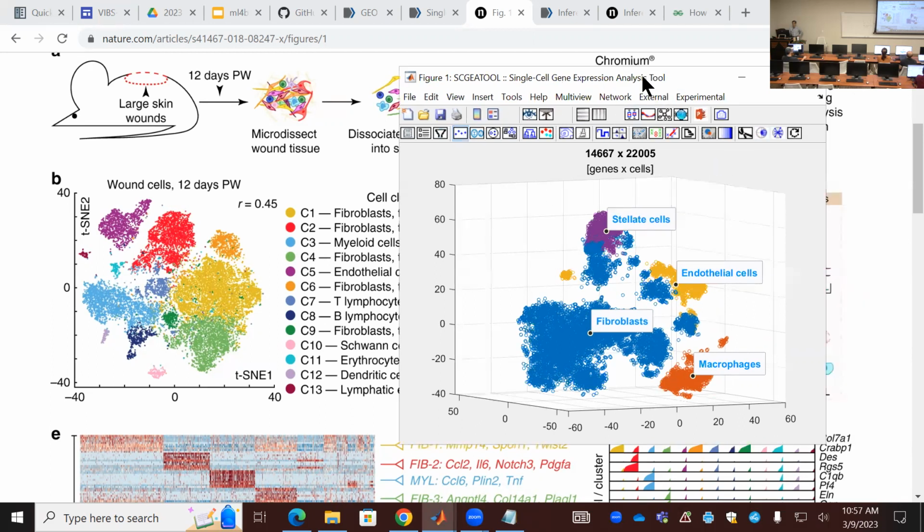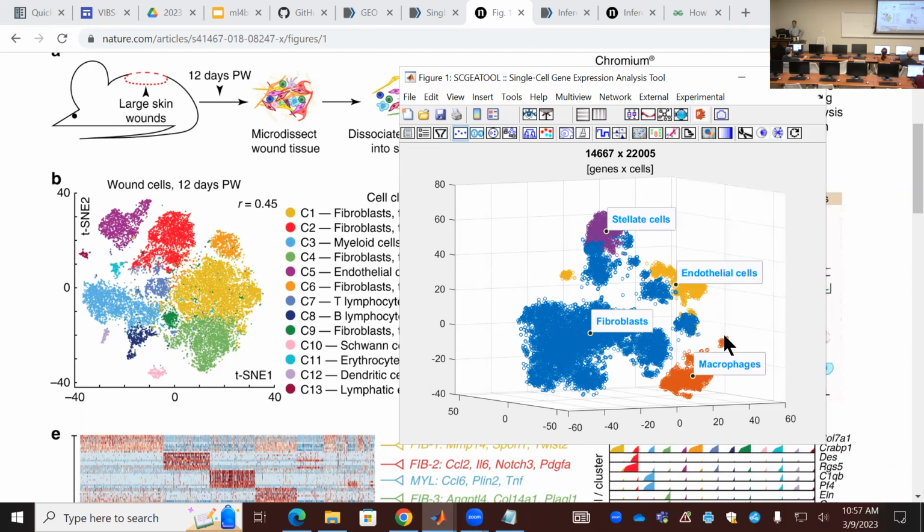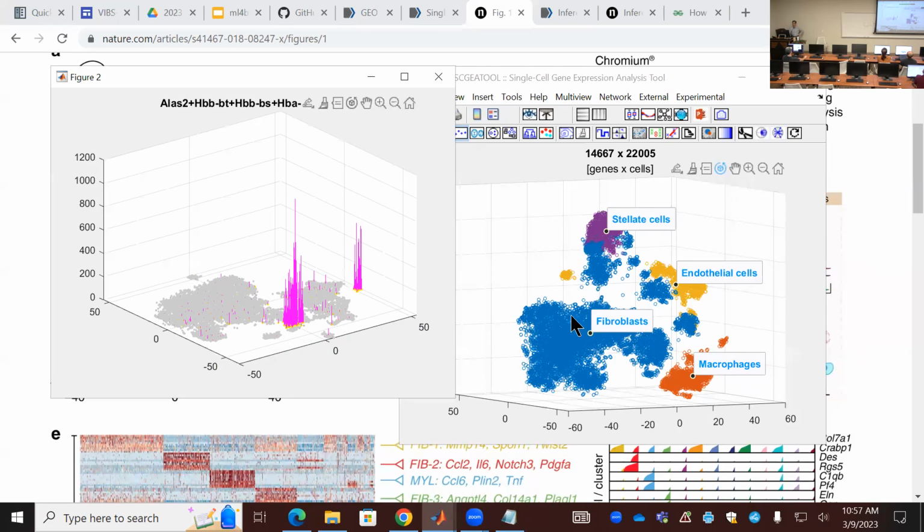Red blood cell has very unique marker genes. So in this manual, we do have this special section to show this gene expression. Okay, so this will help you identify where blood cell is, where we do have some. So looks like there's small clusters here.